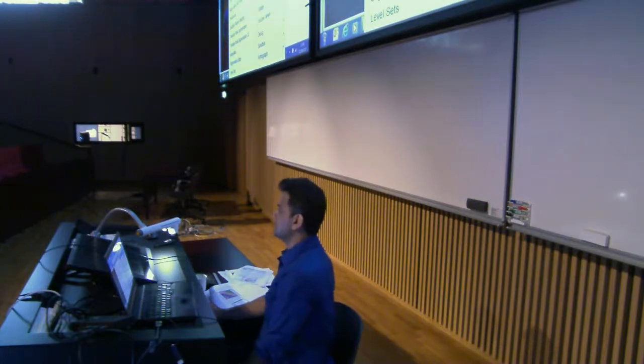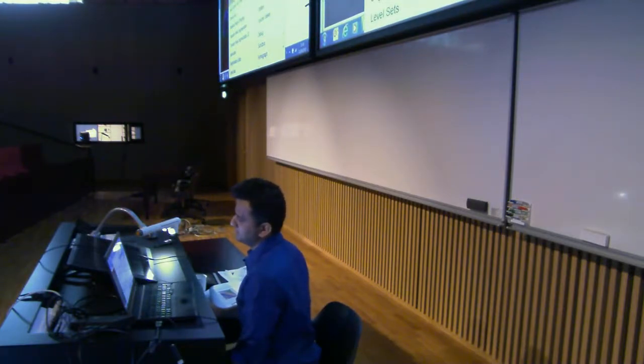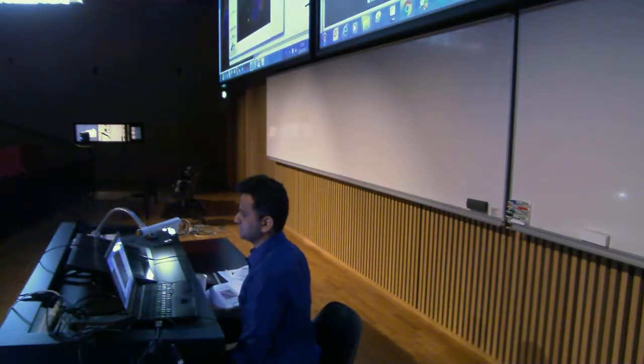Of course, it depends on the data. It's not like Imaris, where you just hit the button and get the result. So you have to see, depending on your data. Trainable Weka Segmentation is a bit popular, that's why I'm going for this.